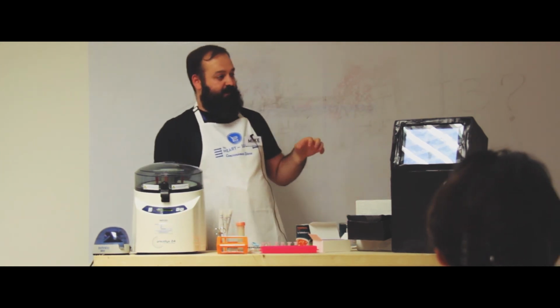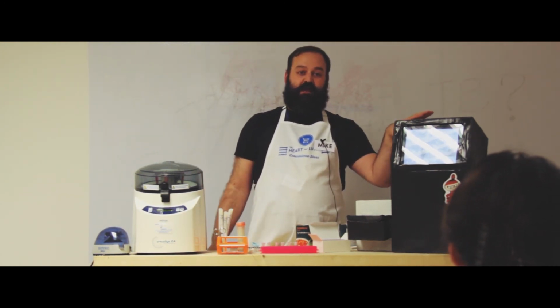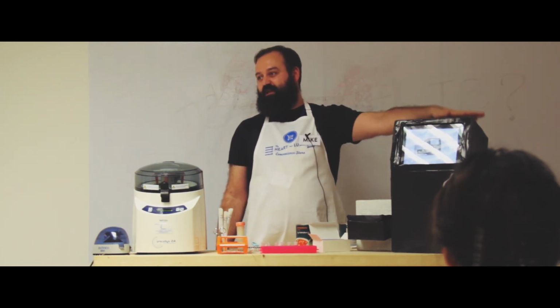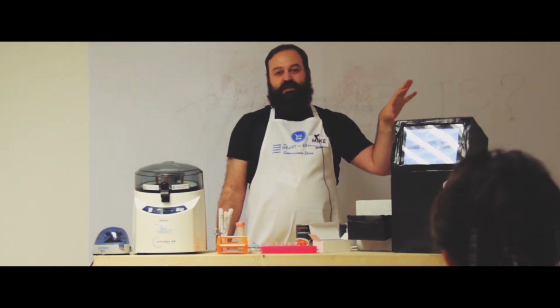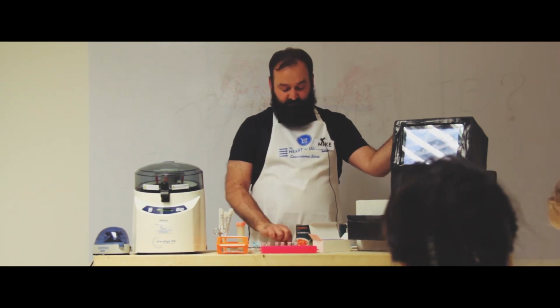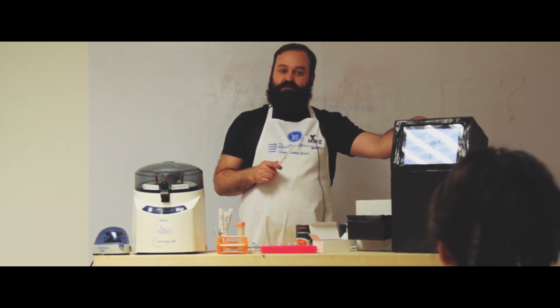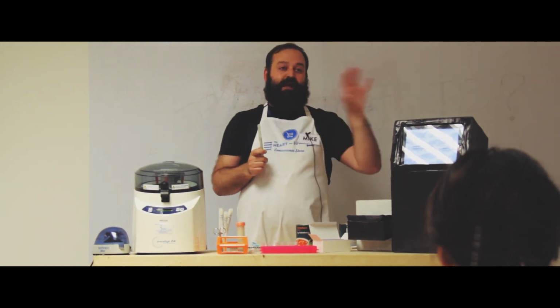And then very finally, our last step is to read the information in the DNA. So I've got this mix of a DNA sample, and I use a DNA sequencer, like this very expensive model here, that reads all the DNA from all the different bacteria in the sample in one go. So that's how I go from Phil's throat swab, or his lung brush, which he was too cowardly to do, down to seeing which bacteria are in the lungs. And if I take lots of samples from Phil over time, I can see how they change and what might happen if he gets sick.